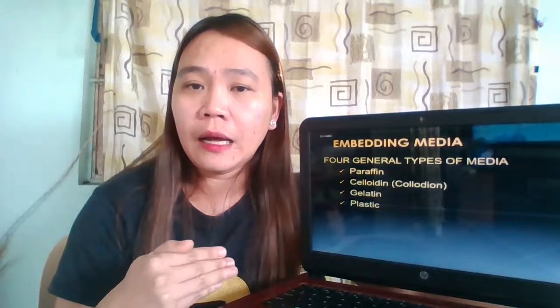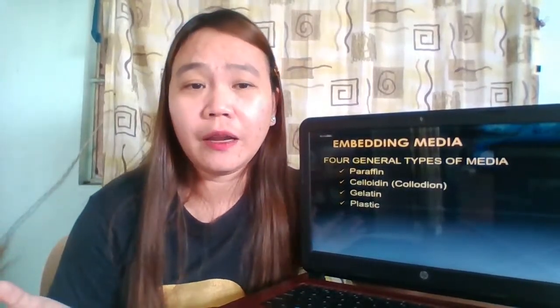I think we have already talked about celloidine or collodion when we were talking about decalcification in the lecture, during our previous meetings, so you are a little bit familiar with it already.